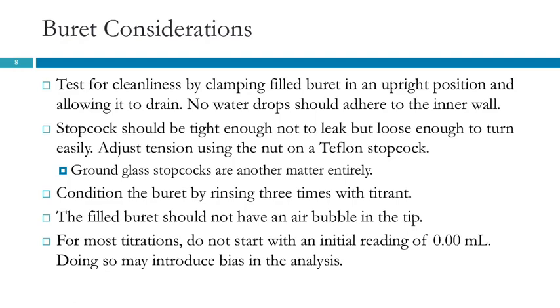Could be interesting. When you fill the burette, you want to make sure you don't have an air bubble in the tip. The air bubble itself is not necessarily a problem. The problem is if the air bubble comes out during your titration. So it's important to get rid of the air bubble.